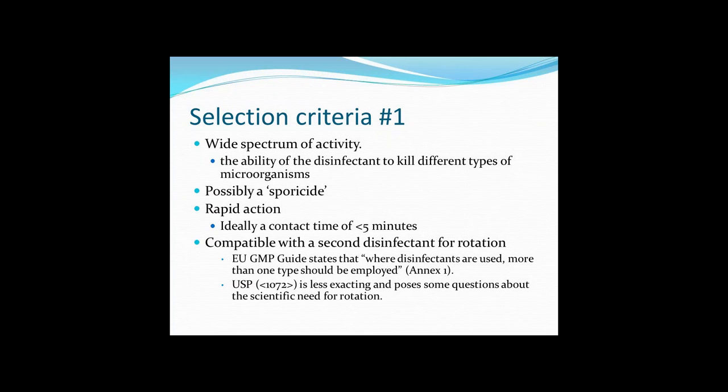If we use a second disinfectant as part of rotation, it needs to be different, but it also needs to be compatible. What we don't want is the two disinfectants working against each other or inactivating each other. And rotation, whether it is or isn't scientifically necessary, is an EU GMP requirement.